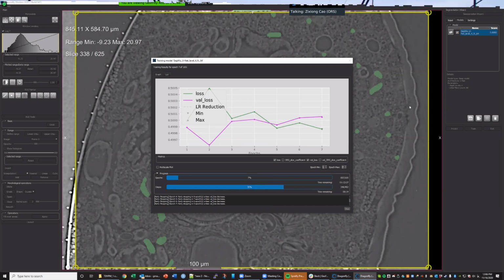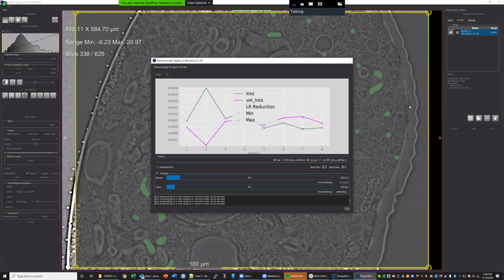Mike did the first deep learning video, I think more than a year ago, using the markup slices as you did, to extract a few slices from the entire volume. That worked well if you do a 2D UNet. A 2D UNet model doesn't take slices other than the one you used for manual segmentation. So that's probably the same.